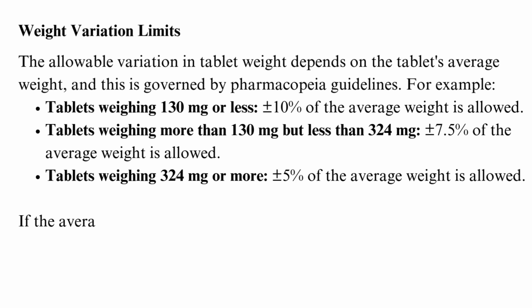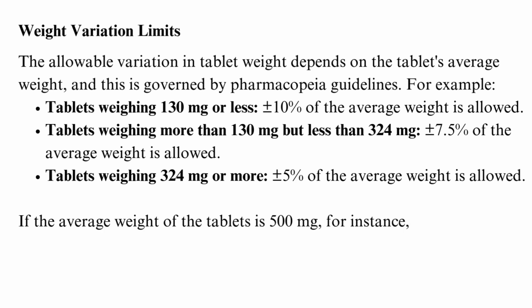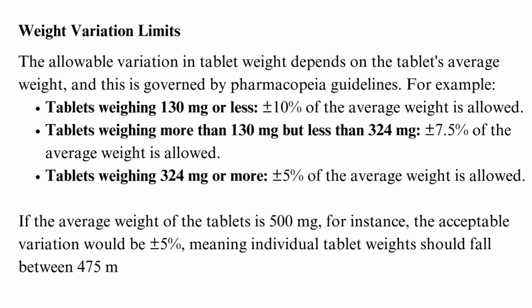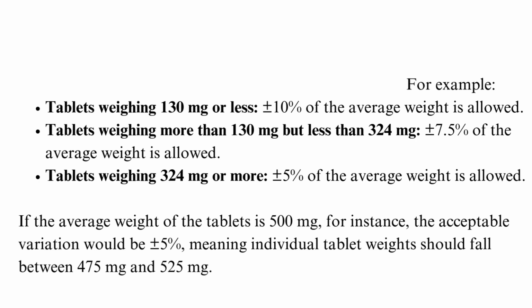If the average weight of the tablets is 500 milligrams, for instance, the acceptable variation would be plus or minus 5%, meaning individual tablet weights should fall between 475 milligrams and 525 milligrams.